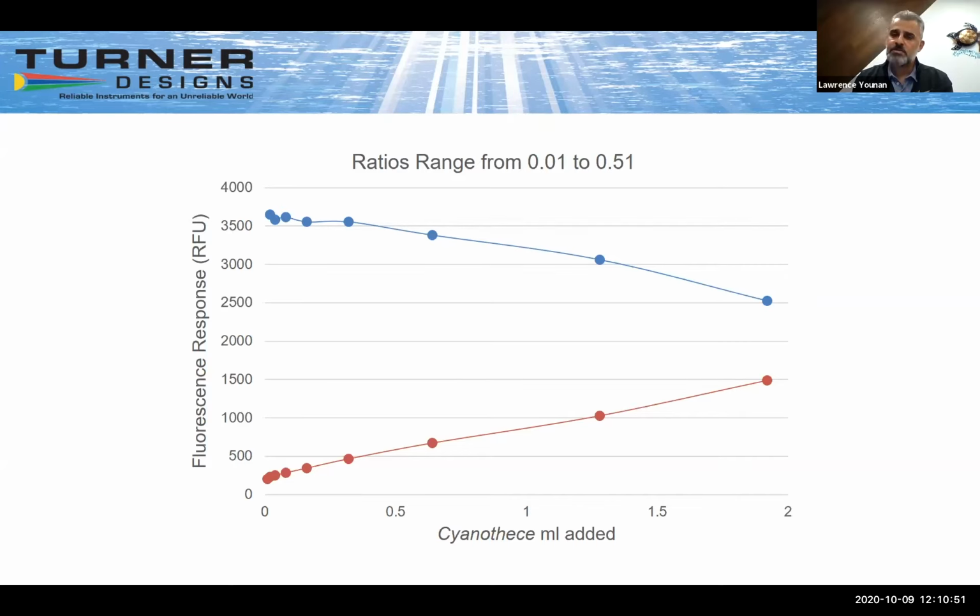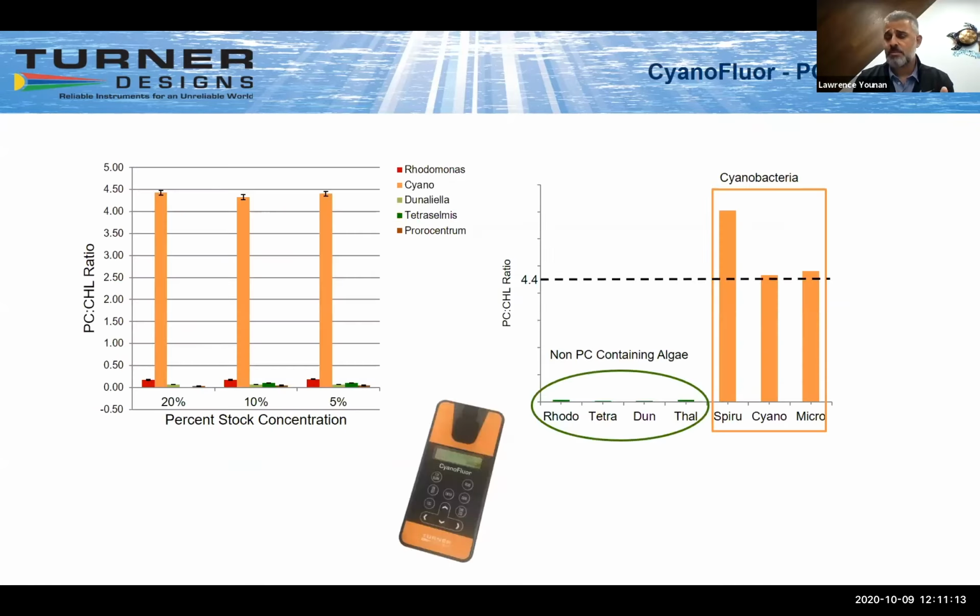And what we get is something like 0.5. That's my ratio, around 0.5, telling me that 50% of that cuvette is cyanobacteria. And that's a great way to look at distinguishing or counting what percentage of your mixed population is this and what percentage is that.